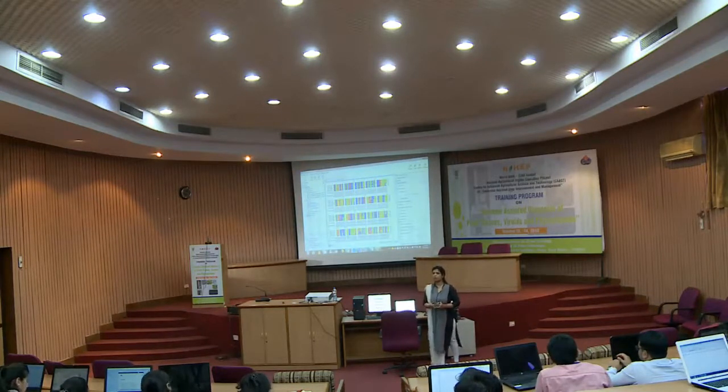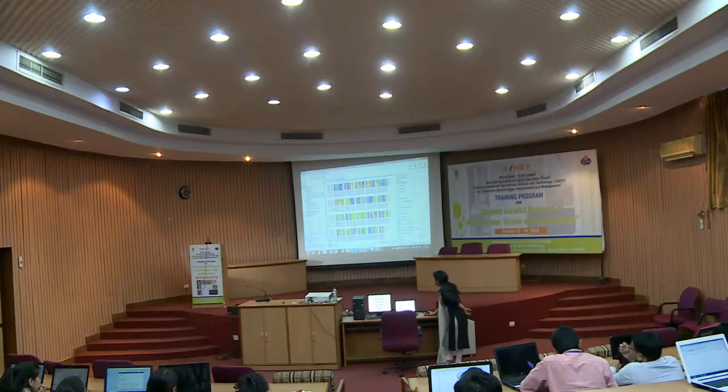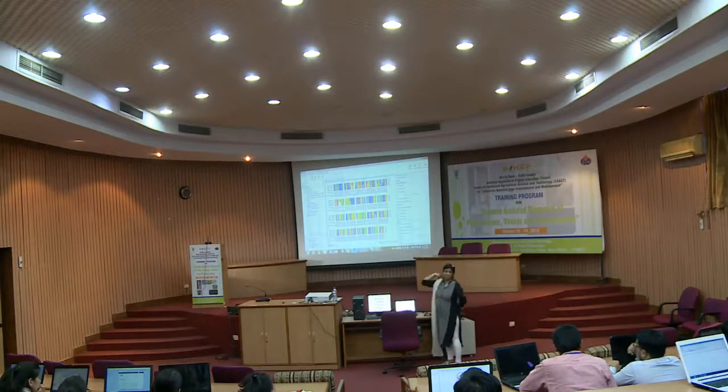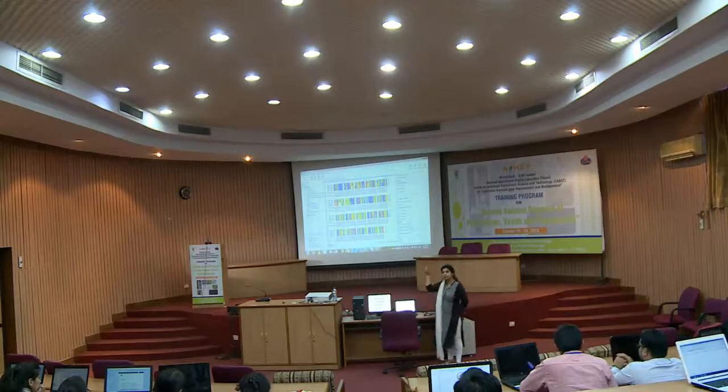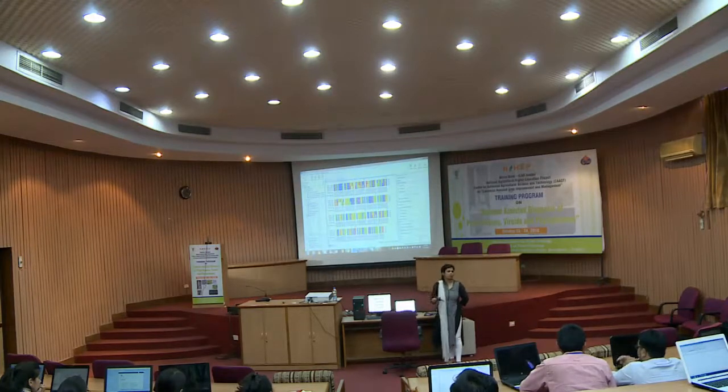Yeah, you want to say something? Okay. So, now here if you can see, everything is starting from the same base and ending at the same base, right. And you can see there are certain deletions in these 2 samples K and A, but in 1 and 2 there are some bases present, G, T, A. It means this G, T, A is actually an insertion of bases in these particular samples.